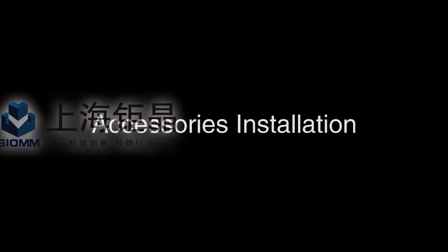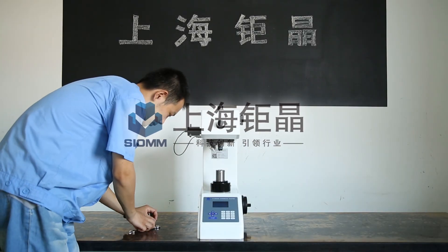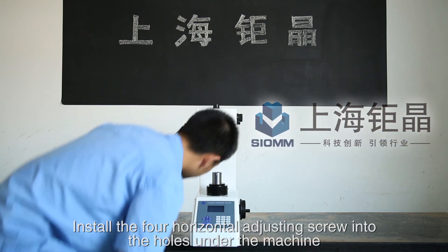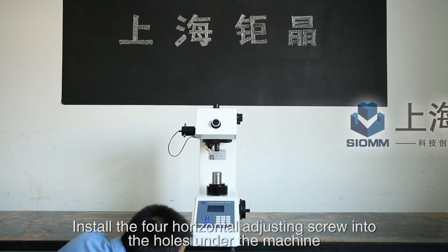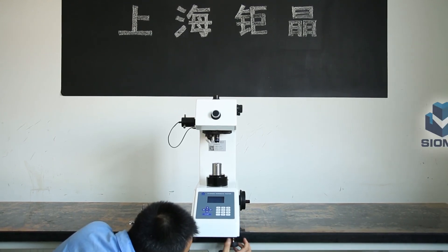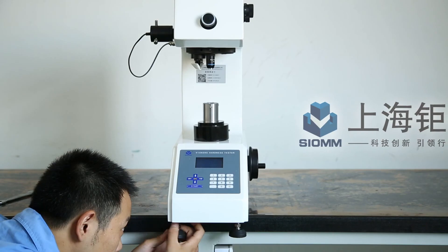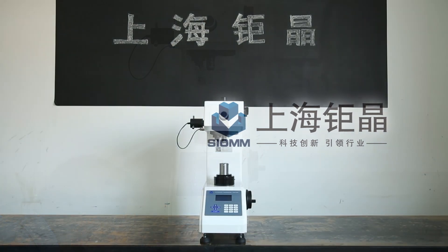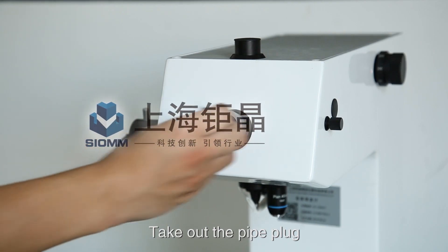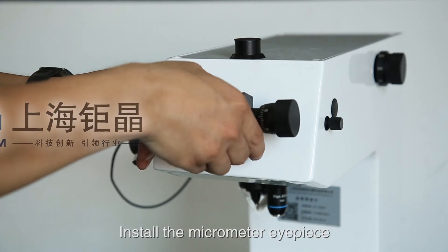Accessories installation: Move the machine gently. Install the four horizontal adjusting screws into the base of the machine. Take out the port plug, then install the micrometer eyepiece.